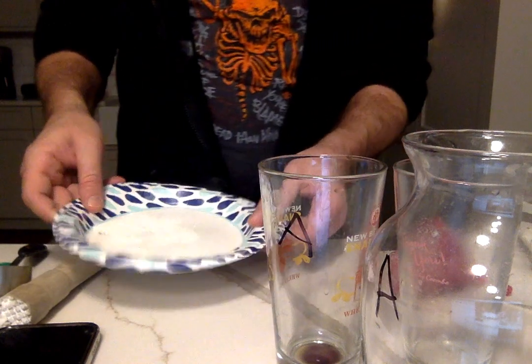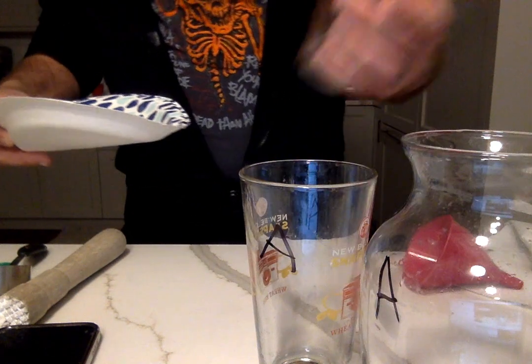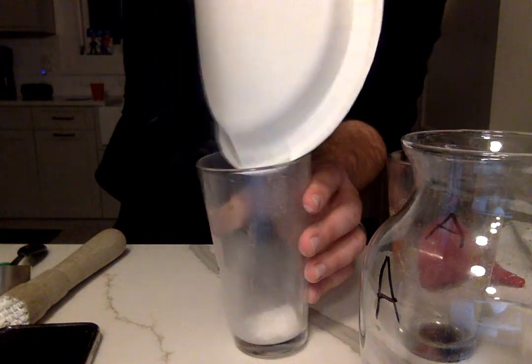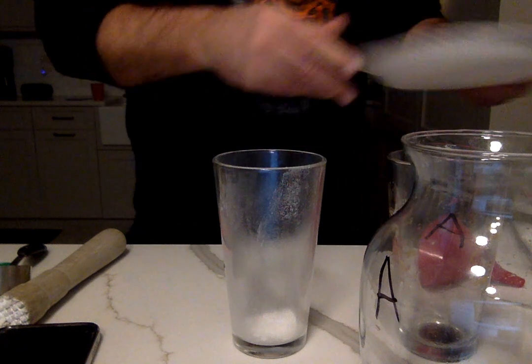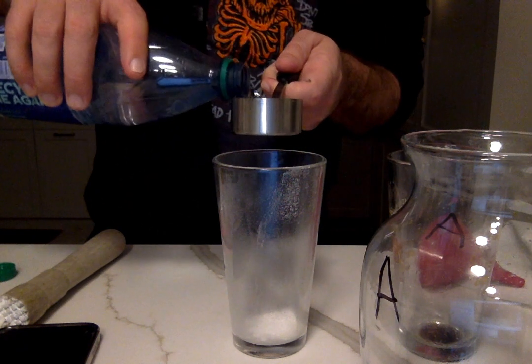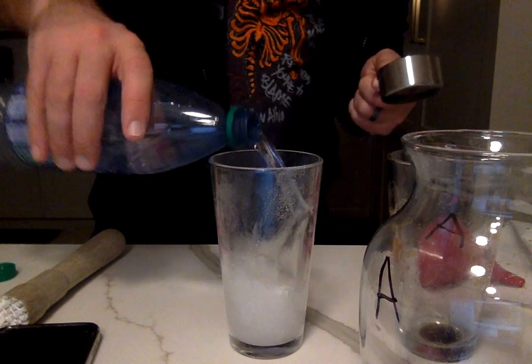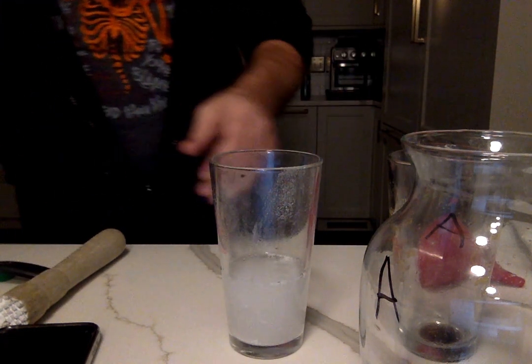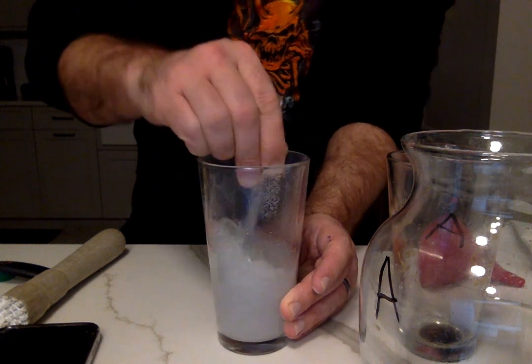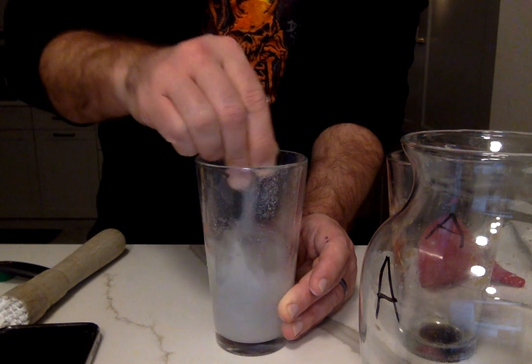First I'm going to take that powdered vitamin C that we just made and dump it into one of our cups. I'm going to add 60 milliliters of distilled water, a little bit more than 60 milliliters, and stir that up for 30 seconds. Make sure it's nice and dissolved.